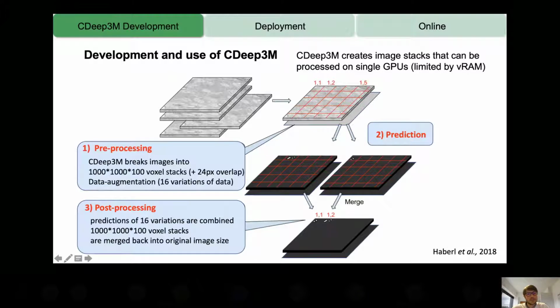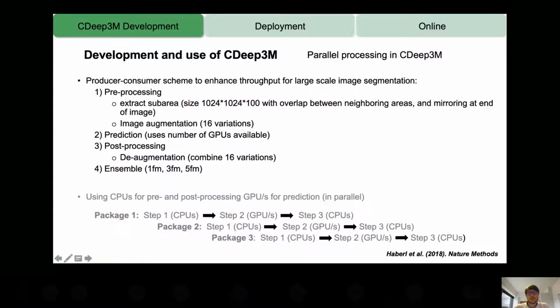At the same time, there's often an edge artifact when you apply a deep neural network and you perform a prediction: the performance is much better in the center of the image than it is towards the edges, where the network cannot really decide anymore if your prediction is as accurate as you would expect it to be. So we built in this overlap between neighboring tiles, and then everything gets merged in the end automatically, and the user just gets the final product without having to worry about these steps.